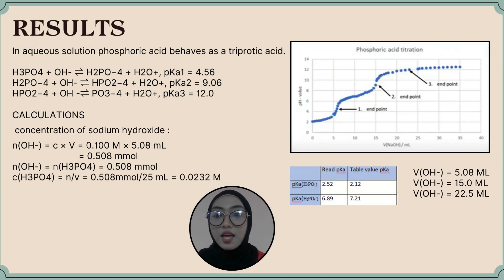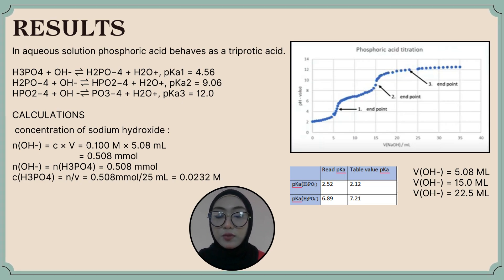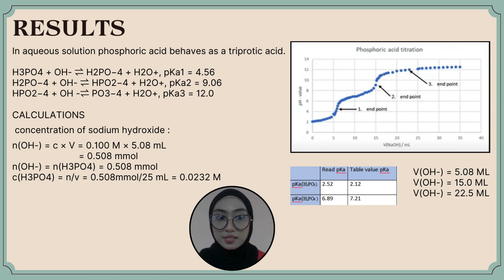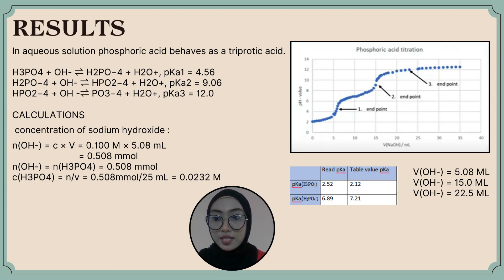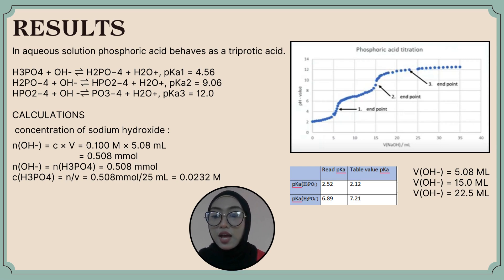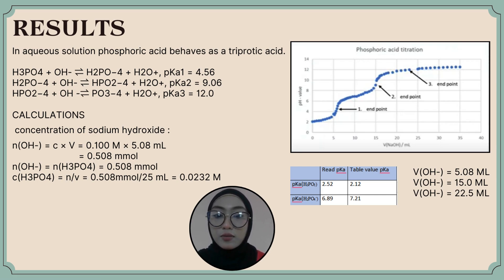My part is going to talk about the results of the experiment. From the experiment, the titration of phosphoric acid involved three reactions. The aqueous solution of phosphoric acid acts as a triprotic acid — we have a medium strong acid, a weak acid, and a weak base. From the graph, it has shown three curves of pH involved in the phosphoric acid titration, corresponding to the volume of hydroxide ion used.